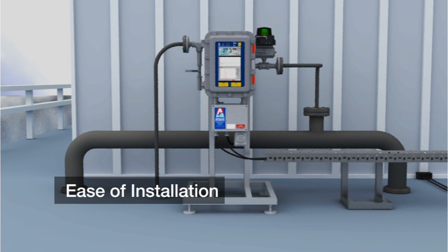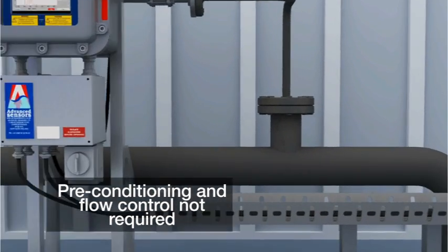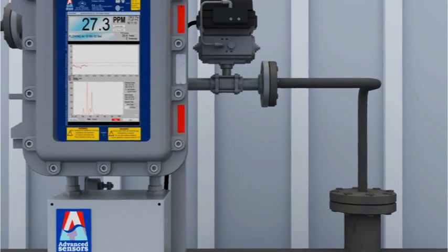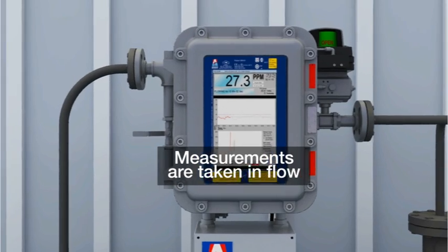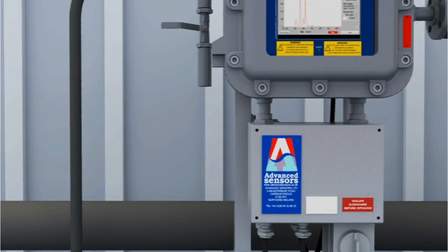Our sidestream products are ideal for ease of installation, where no preconditioning and no flow control are required. Simply tap into an existing sample point, allow flow through the analyzer where measurements are taken in flow and then send flow back to process or drain.